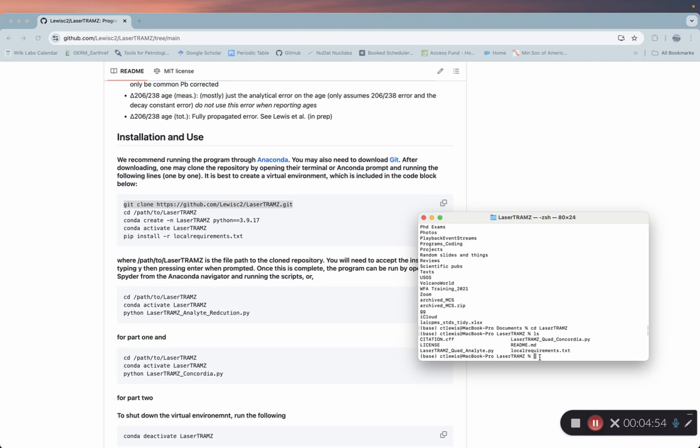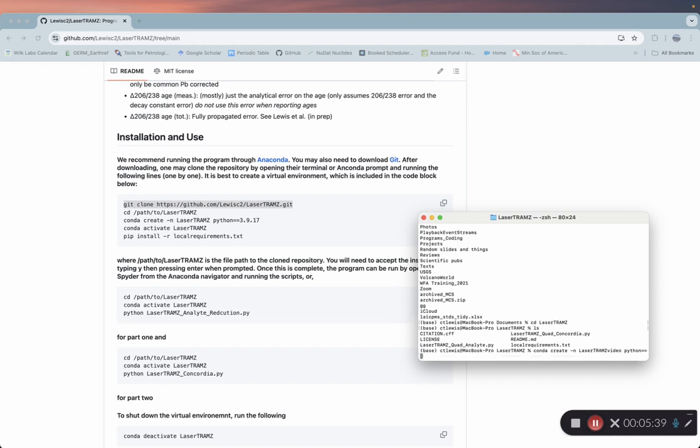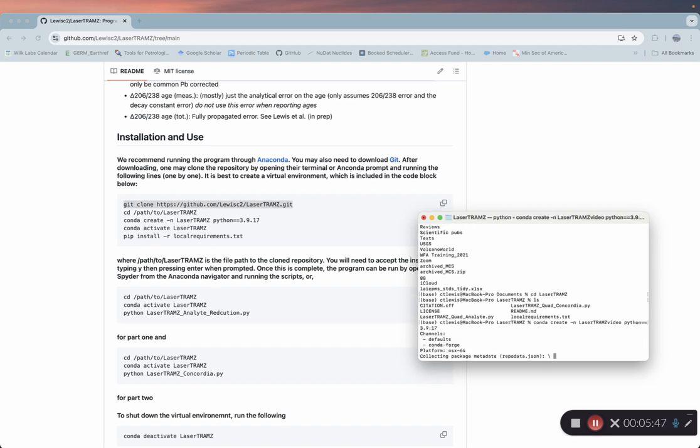Now what we're going to do is create a virtual environment, which I mentioned earlier. This is just a way to have good version control of various Python libraries and packages. That way, if you update Python, you still have this virtual environment that hosts those same packages at the version you want them installed at in order to not have any incompatibilities. We're going to do conda create dash n, and I'm going to do LaserTramZ video because I already have LaserTramZ installed. Then we're going to do Python equals equals 3.9.17.